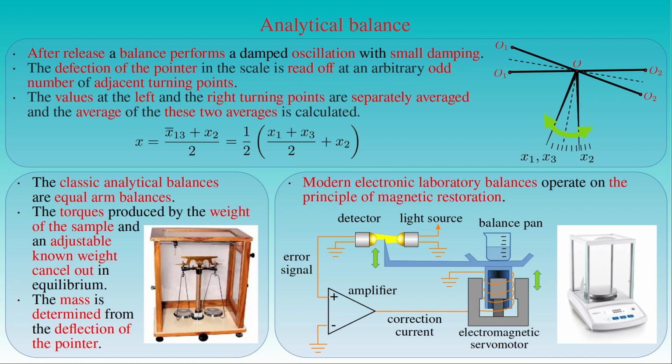The electromagnetic force restoration system counters the weight exerted by the sample against the adjustable electromagnetic force exerted by the coil at a specific spatial position. By measuring the current in the coil and the electromagnetic force generated by it, we can determine the weight of the sample.